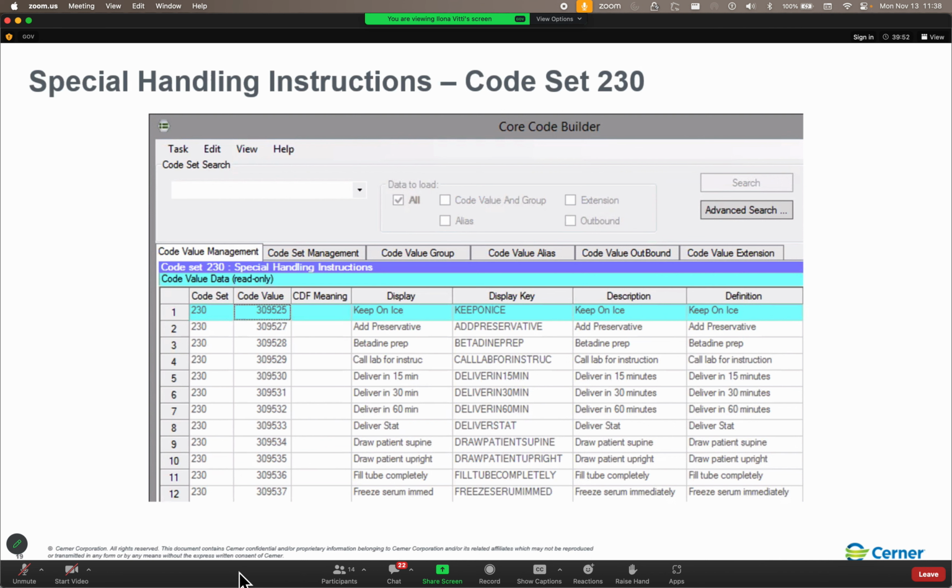Now, for the folks who took the micro class last week, you might remember that when it comes to creating accession classes, you have a unique option. You can allow Bedrock to create that for you. And when we created that accession class in Bedrock, the Julian date format was automatically assigned.